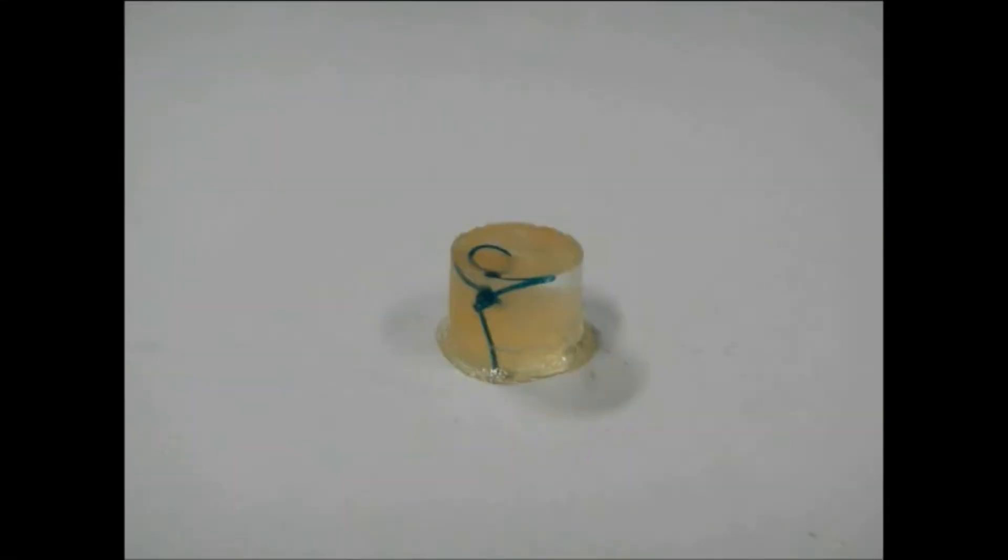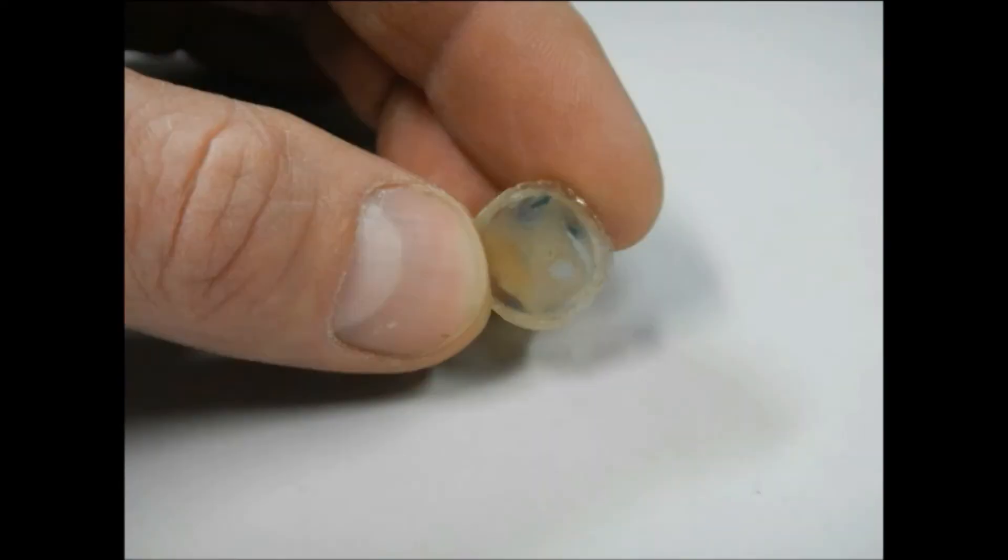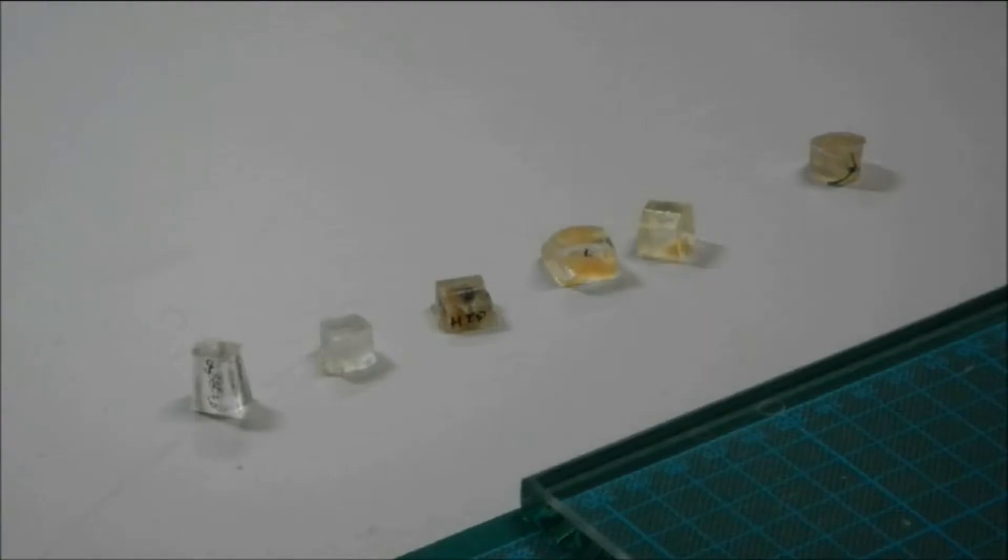The tissue samples are first embedded in a suitable medium and the face that is to be cut gently ground flat. Typical samples include bones and blood vessels containing metal stents.